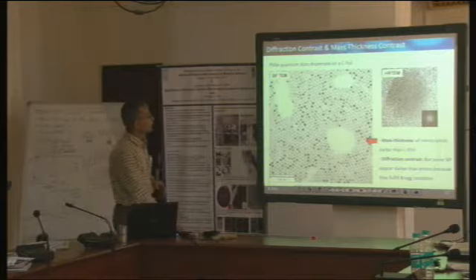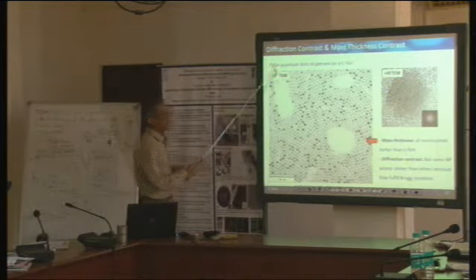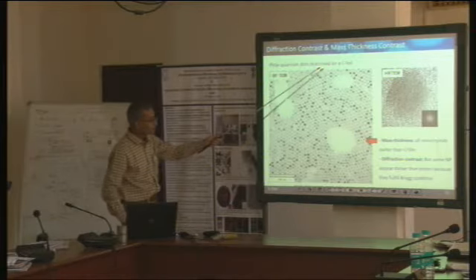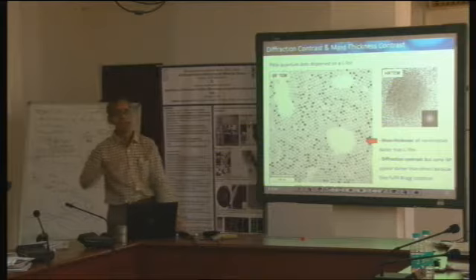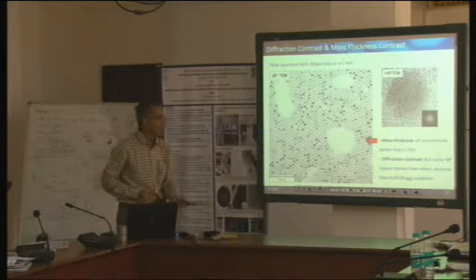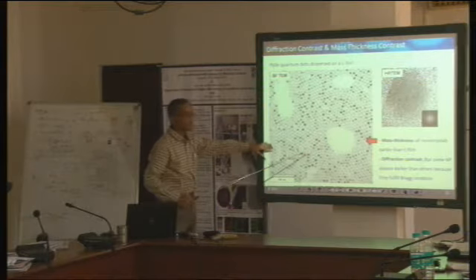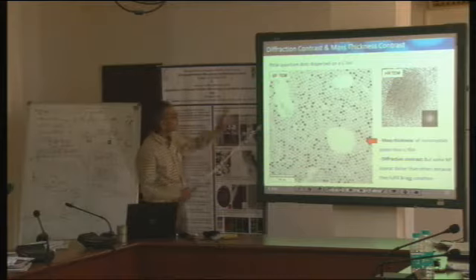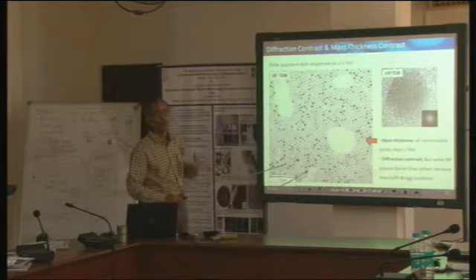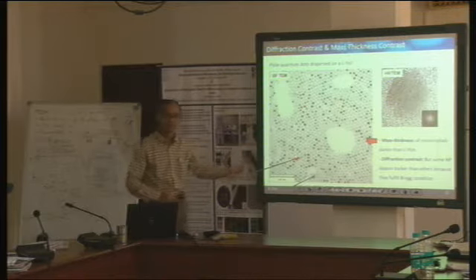Good. Now, here is another example, lead selenide quantum dots on carbon foil, and here we see both effects, mass thickness contrast as well as diffraction contrast. Why mass thickness contrast? Because all these nanoparticles, quantum dots actually, are looking dark. This is a bright field image. They all look darker in comparison to the carbon film which is below them.